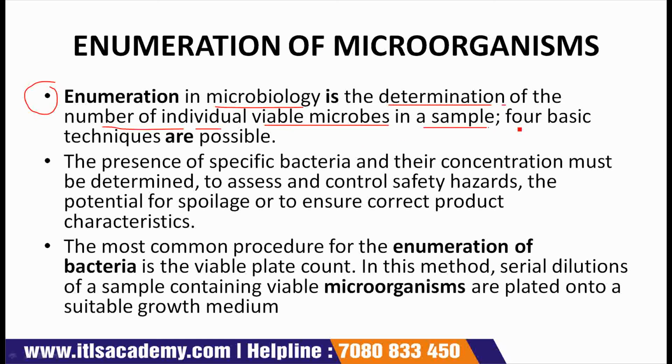Here, four basic techniques are possible. The most commonly used forms of bacteriological analysis in food microbiology are detection and enumeration.